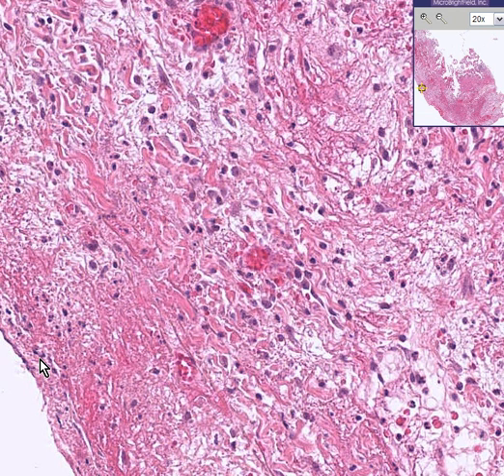Most of these inflammatory cells are all neutrophils. This is acute cholecystitis. Thank you very much.